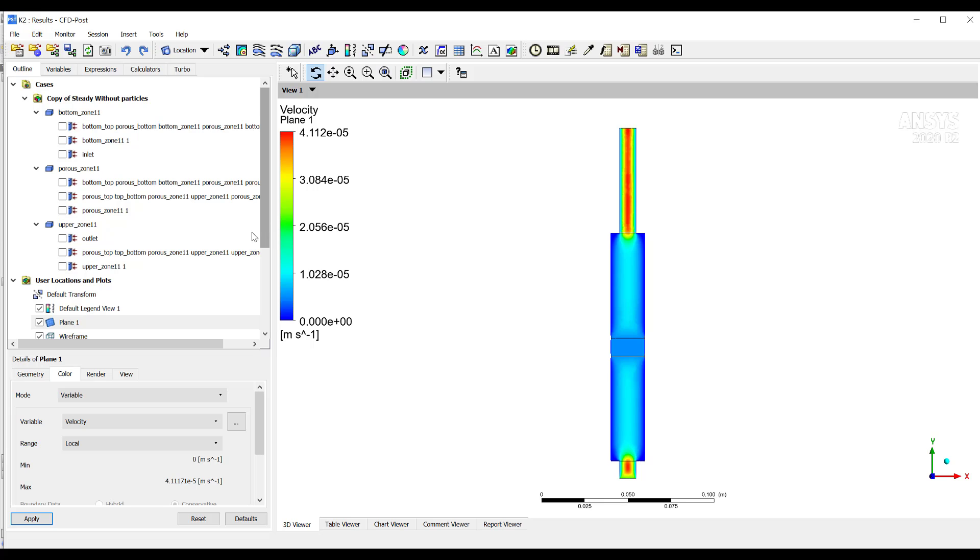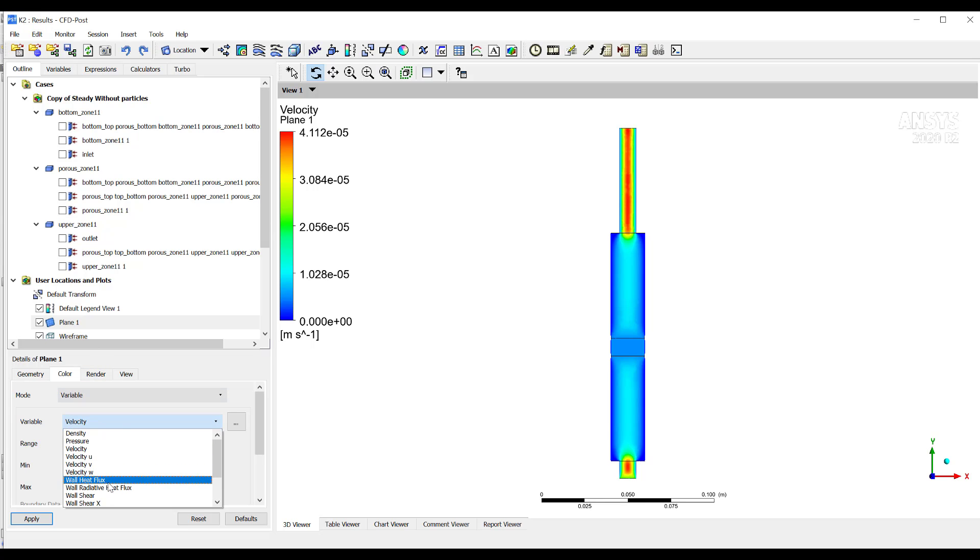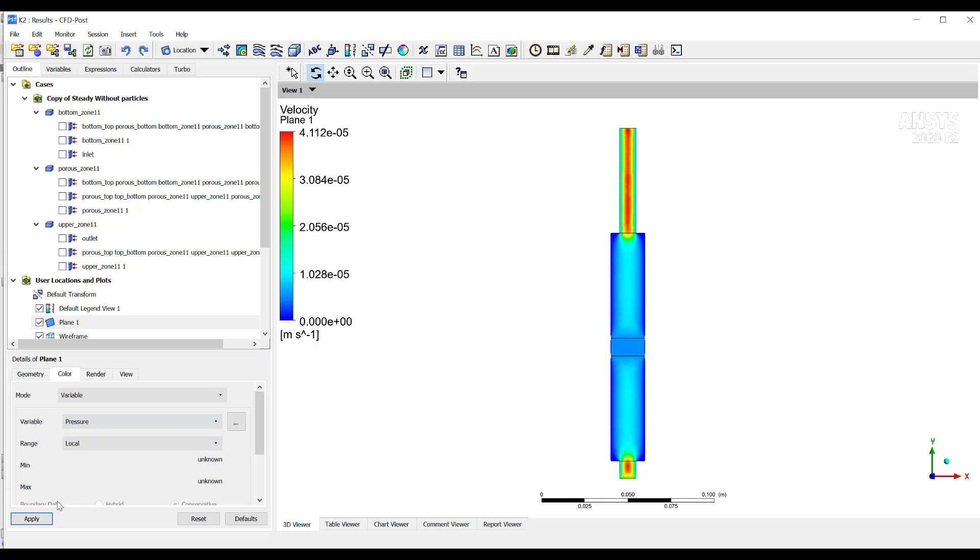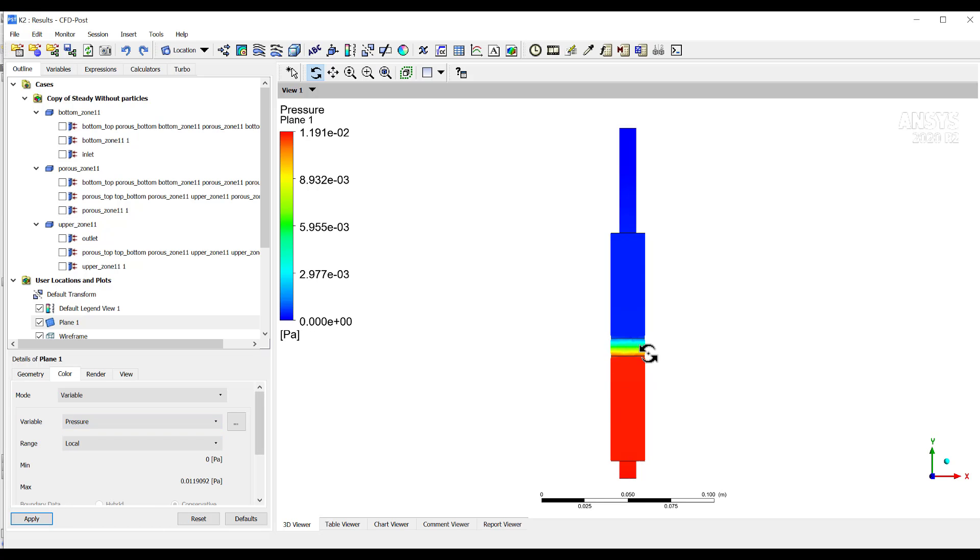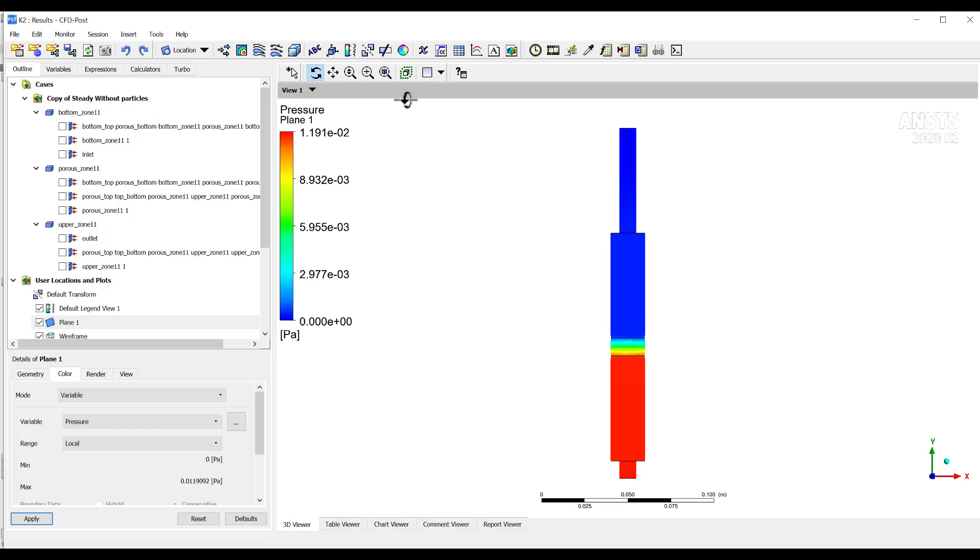Then also, if you want to see, for example, pressure, you can change here and see pressure. And then you see how here in the porous region there is a pressure drop, an important pressure drop because of the resistance of the porous media. And also, you can see a lot of different features of the flow fields in CFD Post that you can play with.